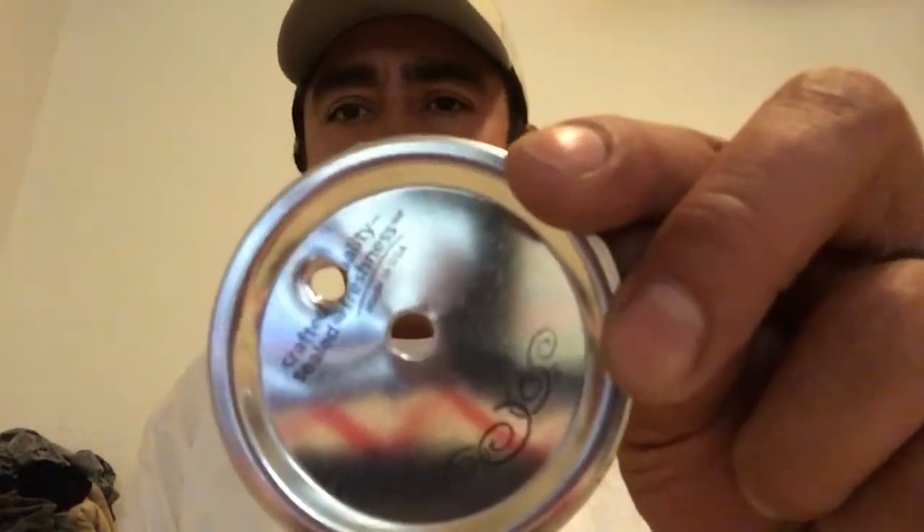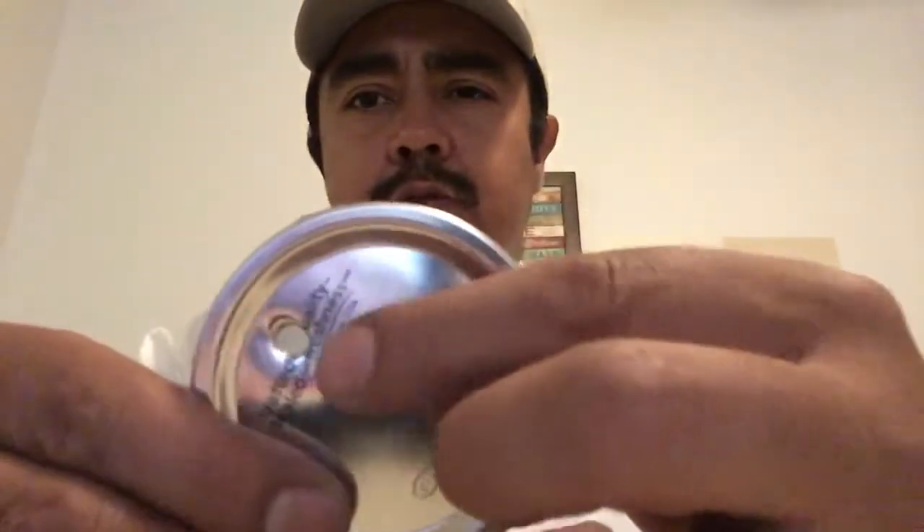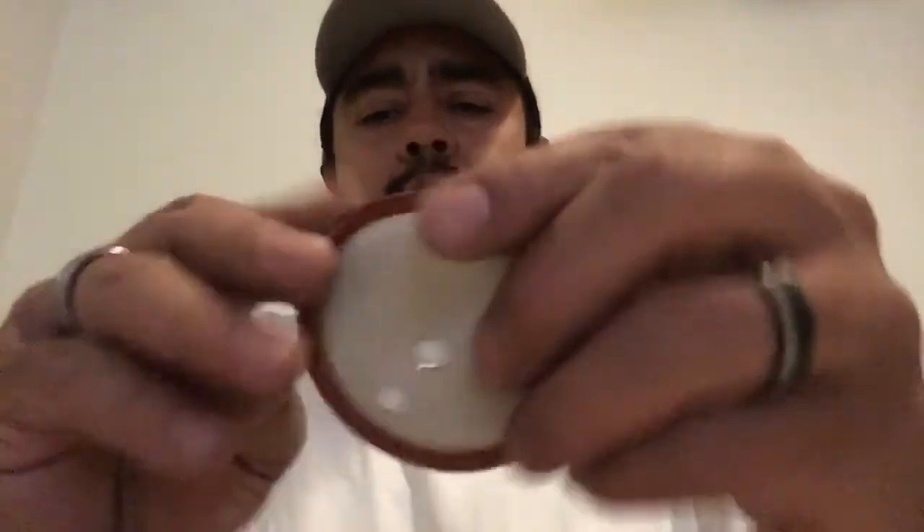If you did everything correctly you should wind up with three lids that look something like that — the injection port in the middle and then a smaller hole for your polyfill. I'm going to go ahead and drill three more real quick. I'm going to be inoculating six jars. I have some different cultures I'm going to expand, and I'll show you that in further videos. For now I'm going to take a short break and do my other lids.